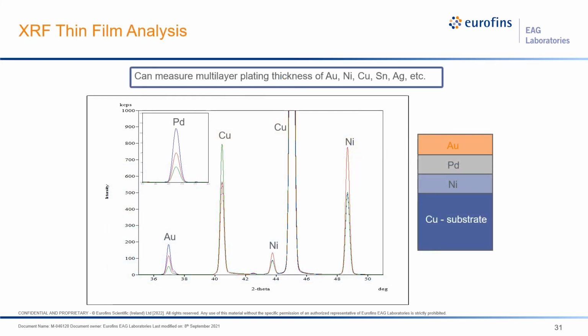The first example is a plating thickness measurement for gold on palladium on nickel films on a copper substrate. This system is used in semiconductor package applications. We see in the scans that we have strong signals from all 3 layers as well as the copper substrate, so we can be assured that we're capturing the full analytical volume.